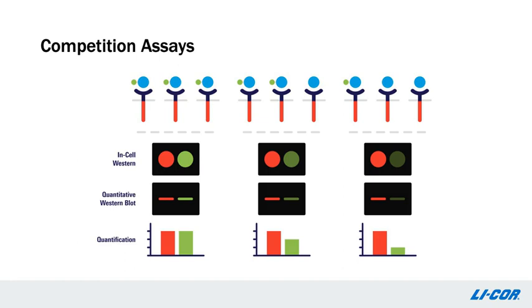For therapeutic discovery and screening, it is essential to understand how a therapeutic binds its target in or on the cell. Competition assays allow for therapeutic and target interactions to be measured, as well as information related to the degree of affinity to be determined.